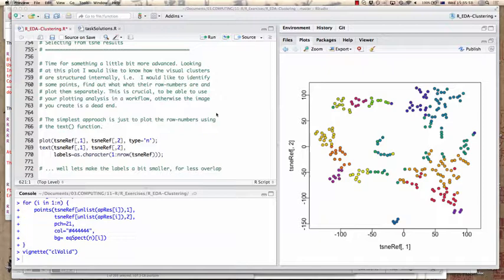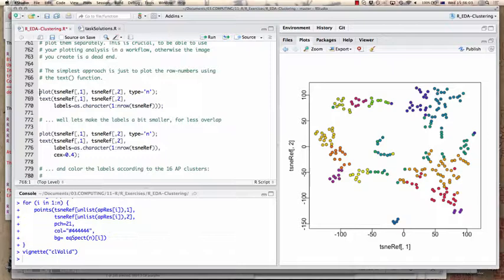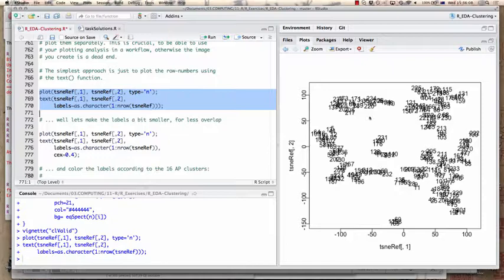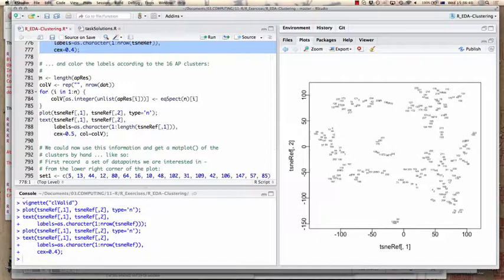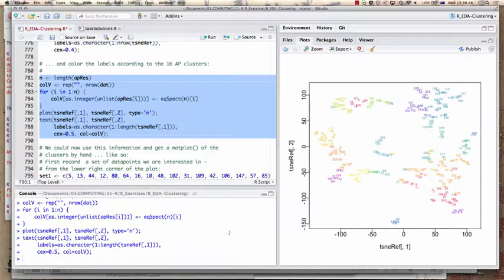The simplest way to work interactively is to plot our points as numbers, squint at them, and try to read the numbers — maybe making them smaller to reduce overlap. Even if we color them by their affinity propagation cluster assignments, it's still tedious to identify specific elements. We can take out three clusters from the lower right-hand corner, define three different sets, and plot the expression profiles. The colors correspond to those in the previous plot — purple, orange, and yellow — and affinity propagation distinguishes these quite well.